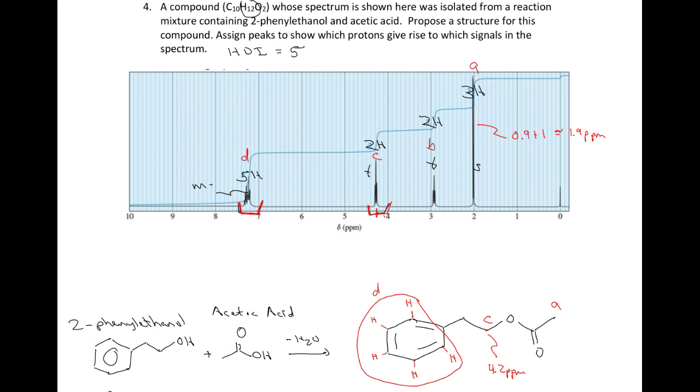All right, and the last one, B, we'll stick in here. Does that make sense? Well, if we think about the chemical shift of these protons, B should be 1.2 plus 1/5 of 3, so 1.2 plus 0.6, which gives us 1.8 parts per million. Is that what we're seeing here for B? It's above 1.8 parts per million, but that makes sense because it's adjacent to the aromatic ring, so it's going to experience some deshielding because of the pi electrons in the aromatic ring. So we could even write greater than 1.8 parts per million, and that makes sense to me.